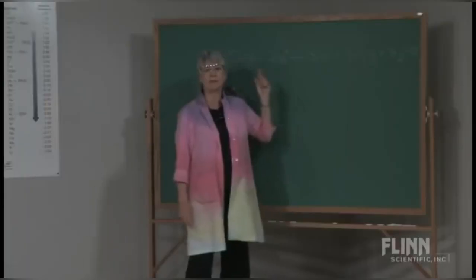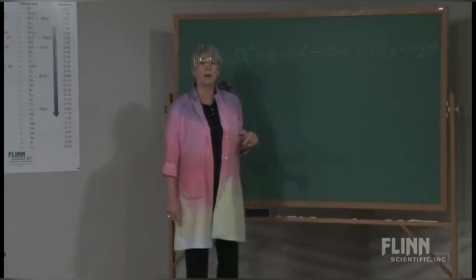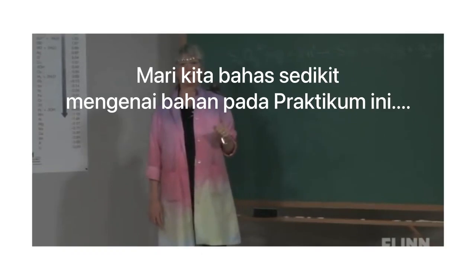You may have done this reaction as part of a chemical sunset because there's a nice demonstration people do when they're putting it on the overhead projector and they can see as the colloid forms more and more.